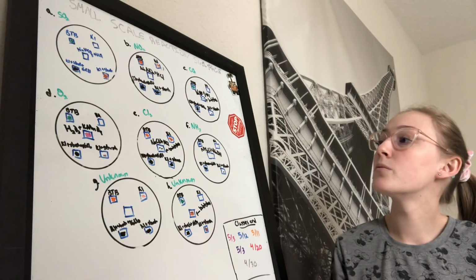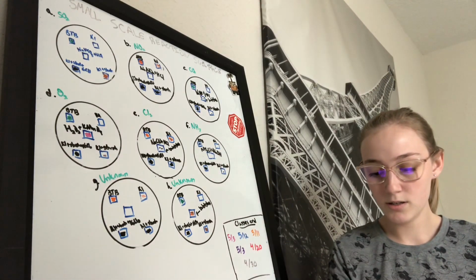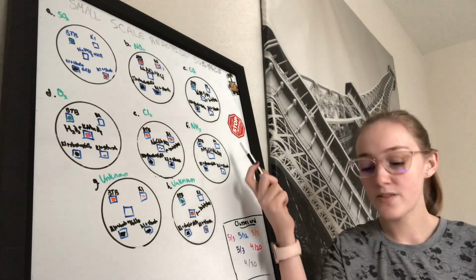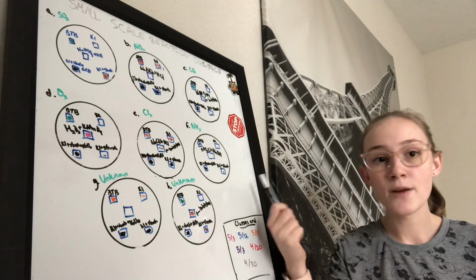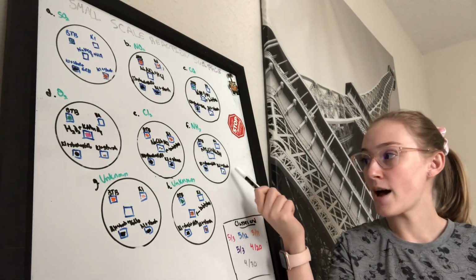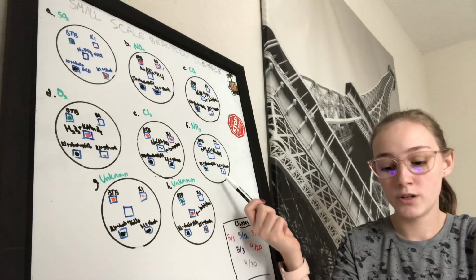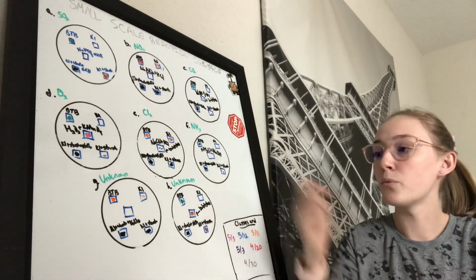So F, which is NH4Cl plus NaOH. You had that BTB changed from a dark green to a blue. The KI remained colorless. You have the KI plus starch, which turned into that sandy brown color. And then you have the KI plus starch plus NaClO, which did not change at all. And then you have a clear portion in the middle.